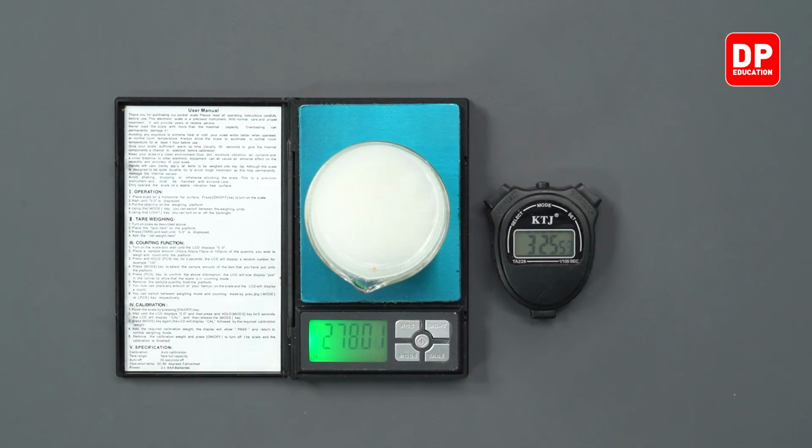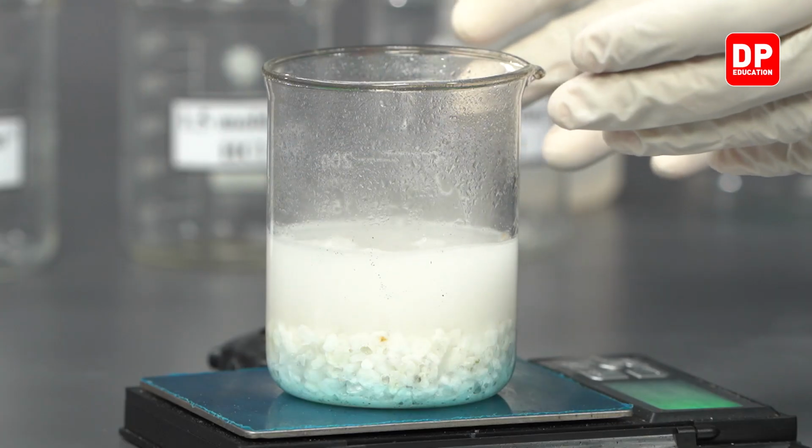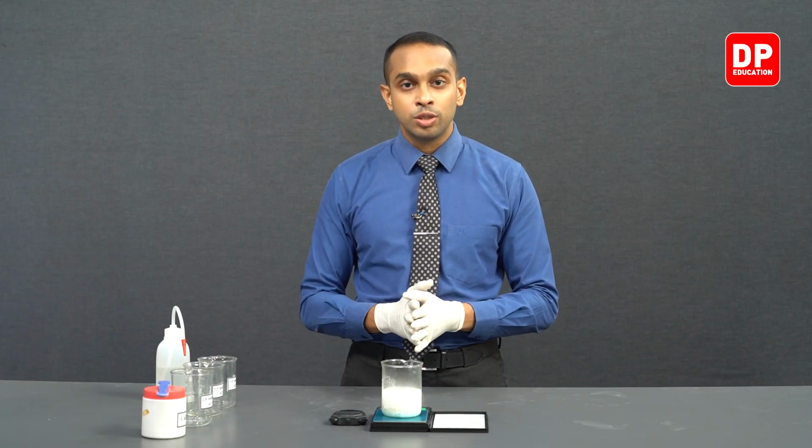So students, you can very clearly see as time passes by, the mass changes, and when it comes to a higher concentration of HCl, through the measurements you obtained, you have to calculate if the reaction was happening faster or more slowly. So that's why we take all of these readings.